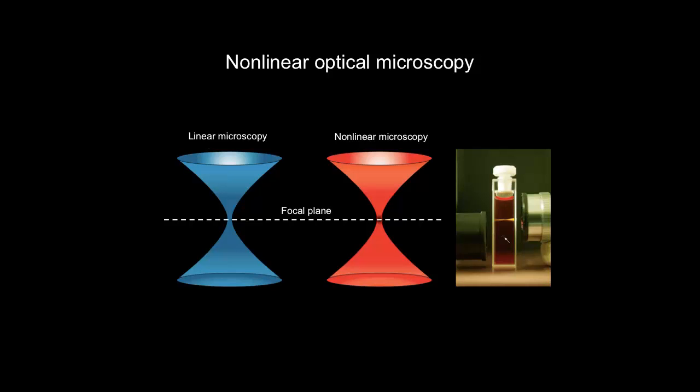Is this what you mean, that I should have adjusted the beam waist? The size of the laser beam on the focal plane. Yes. The nonlinear microscopy should be thinner. You mean the size of the excitation or the size of the emission? The beam waist at the focal plane thinner because you have too much power.